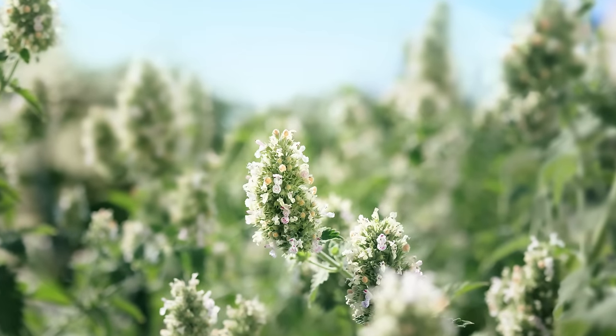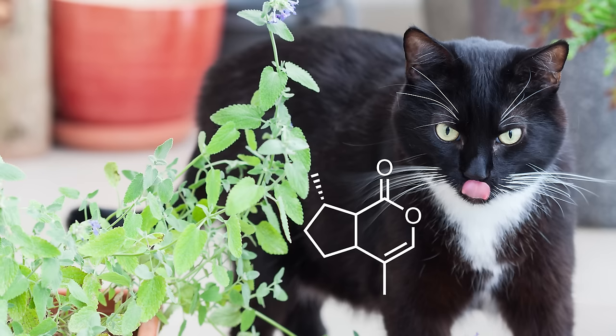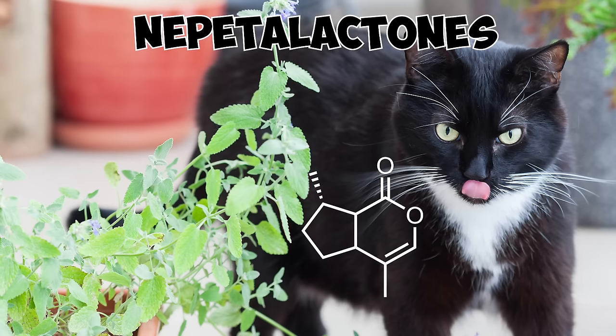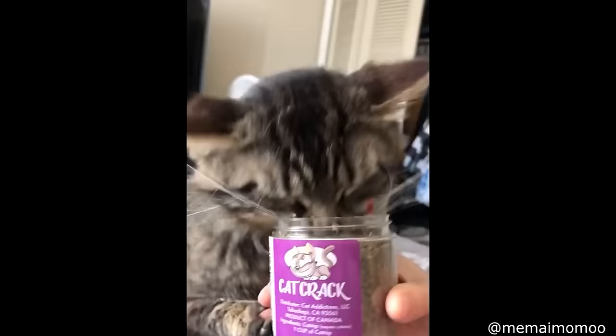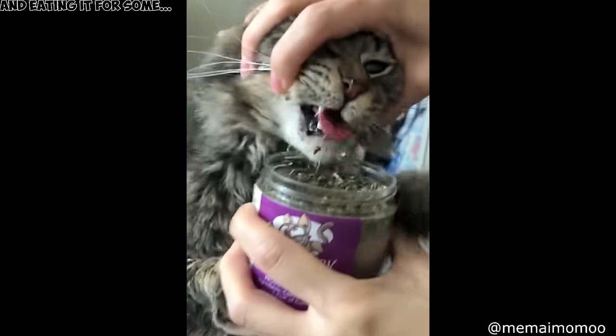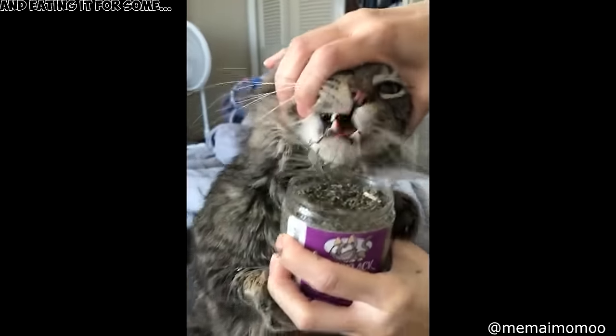It happens to be that cats evolved to like the catnip plant, which contains insect-repellent molecules called Nepetalactones. Since it's beneficial for cats to also be insect-repellent, sensing the molecule gets them high, and compels them to start rubbing their fur against the source of the molecule. That sounds like something I need, but I want it pure.